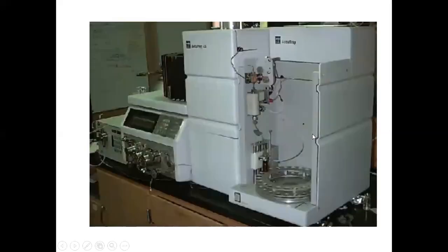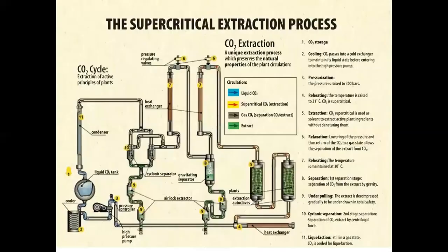Here is a pilot scale supercritical fluid extractor, available in various research laboratories. This is a schematic diagram and shows the various important steps of a supercritical extraction process.